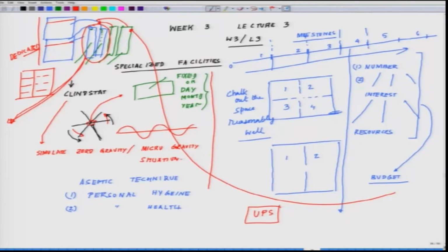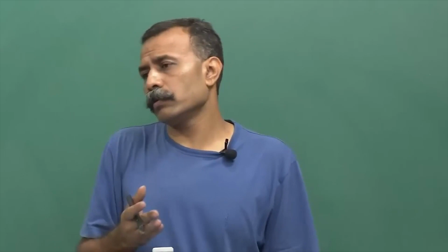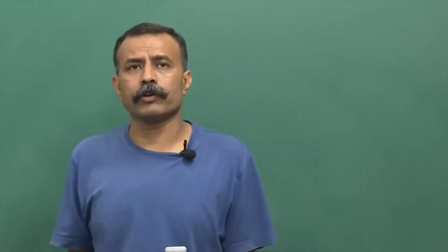Laminar flow you can avoid, fine, there is no light or no power, you can get around. But in India, this is not only India, I mean across the world, this is a problem. There may be sudden power surge or sudden power drop. How you get around it?